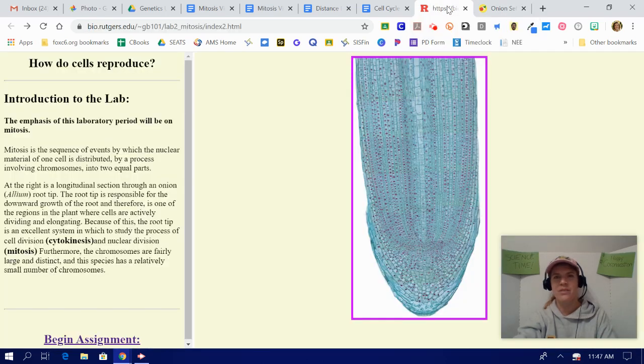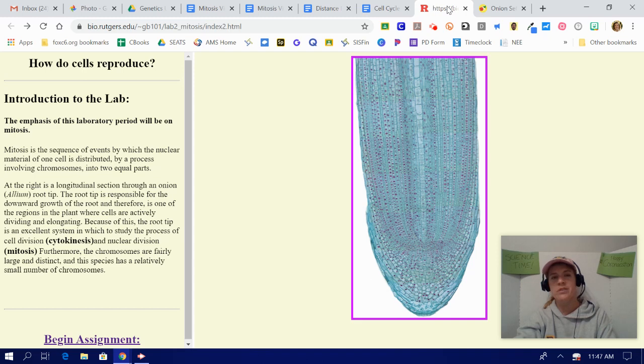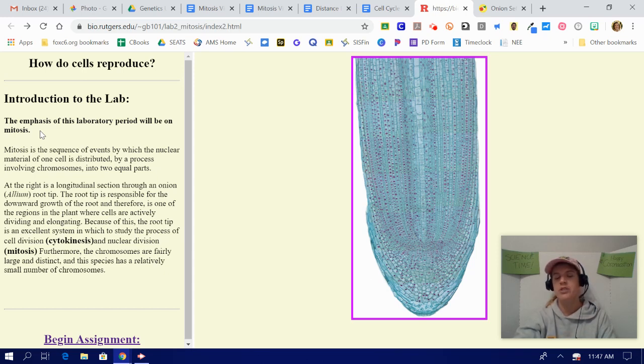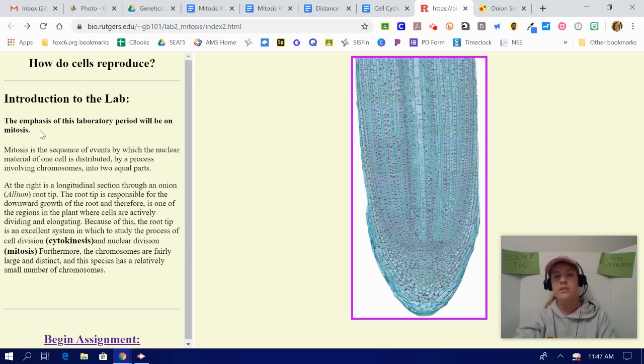Now that we got that out of the way, for those introductory questions over here to the left side of the screen where it says introduction to the lab, that is exactly where you are going to go ahead and write down and put the information and answer the questions about what is it that we're looking at. And I already helped give you some of those answers. When you're ready to start, you're going to scroll down to where it says begin assignment.